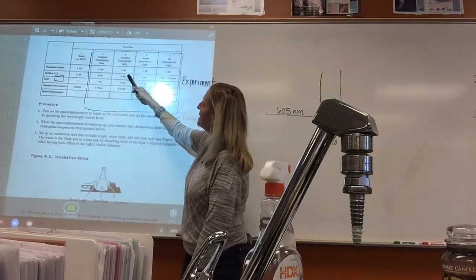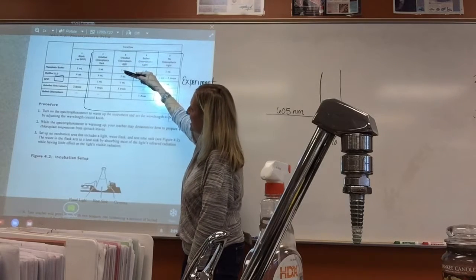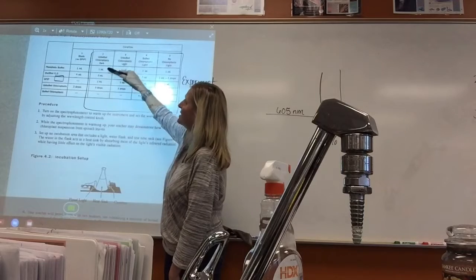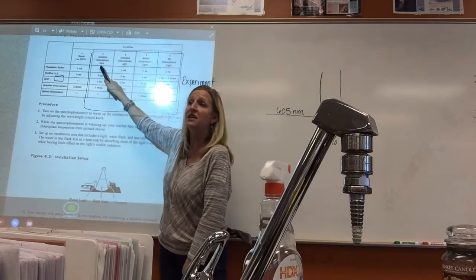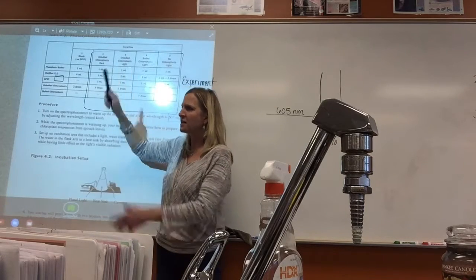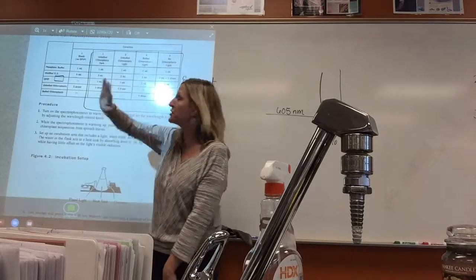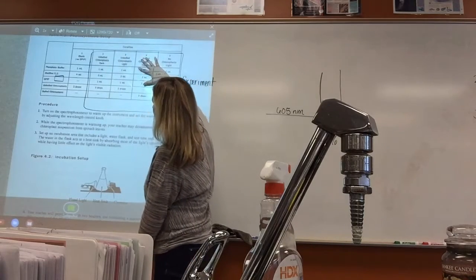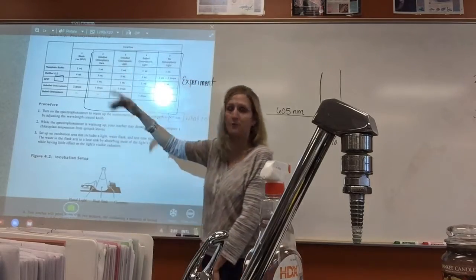And so then notice here, test tube 3 is unboiled chloroplast in the light. It's set up exactly as test tube number 2. So these two together are testing whether or not light is present. Does that make sense? So if that's the only hypothesis we were doing, our lab would end up with just these two as our two groups to compare.